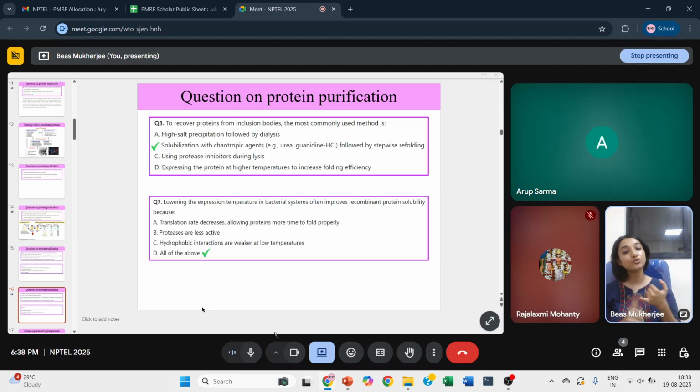You can add in urea. You can add guanidine hydrochloride, which is also similar to urea. You can see the chemical formula, it is very similar, right? And these are actually agents that help in further unfolding the protein. So when you're completely unfolding the protein, then all the interactions of that particular protein with other proteins, nucleic acids, and everything else is gone, right?